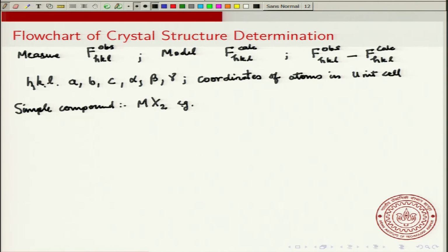Then you need to know, as we said, that there are several parameters, and usually it turns out to be only a few parameters that need to be determined. So, about 5 parameters, 5 variables.